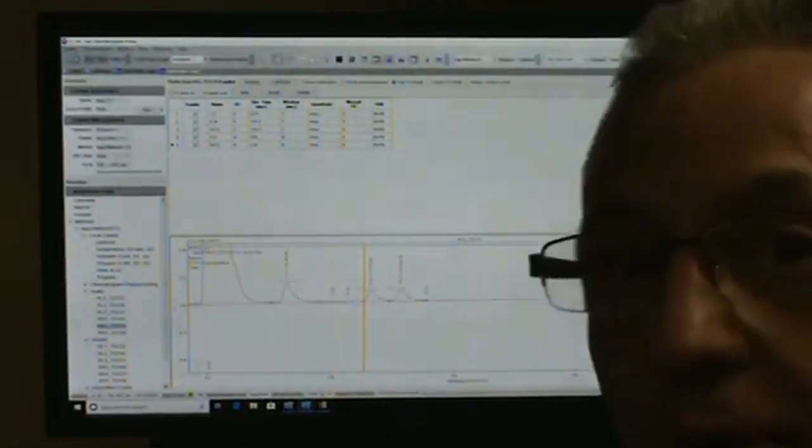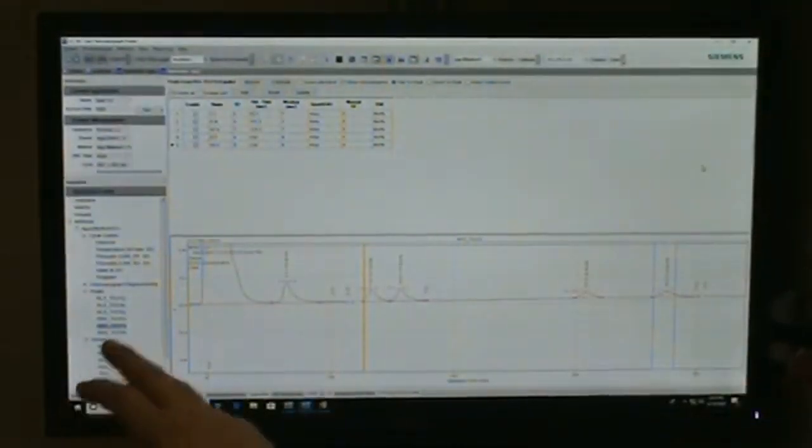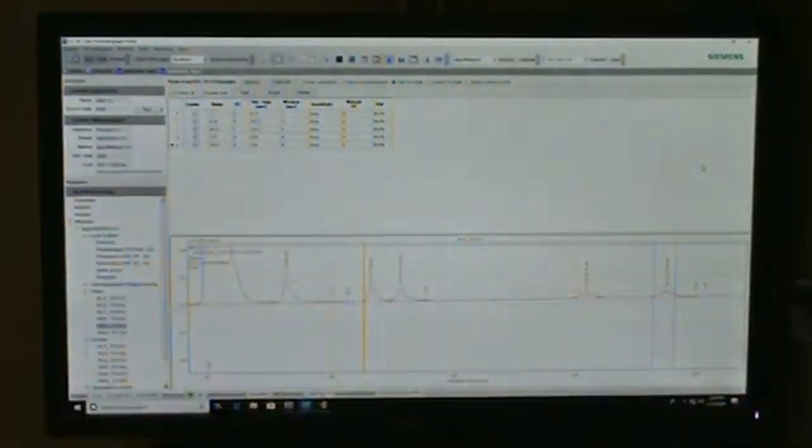Okay, boys and girls. Okay, so we are at the end of our run. We're in hold. 292 second time. We're on app 2, stream 2. Everything good? All right, so let's go up here. Let's go to our chromatogram. Am I seeing this all?